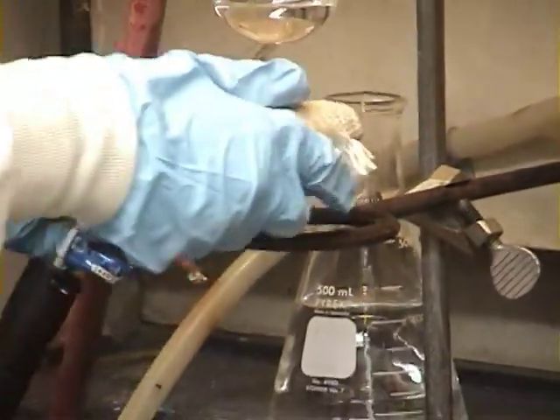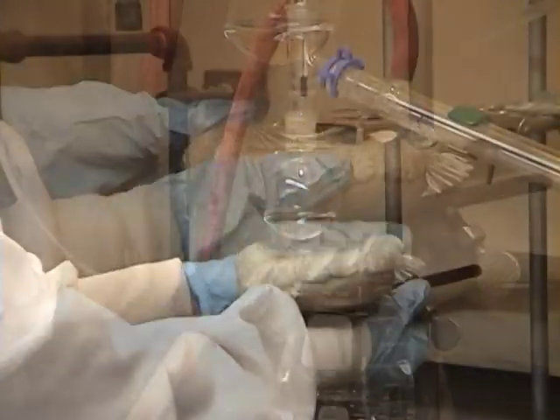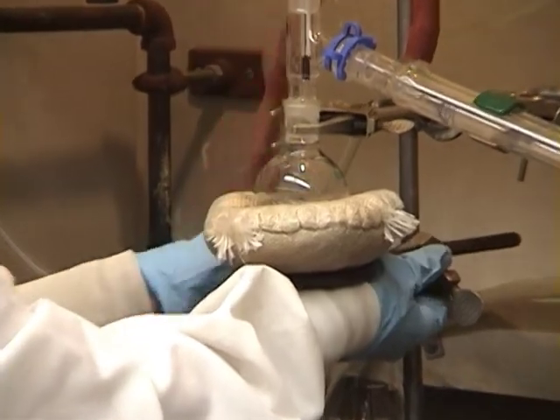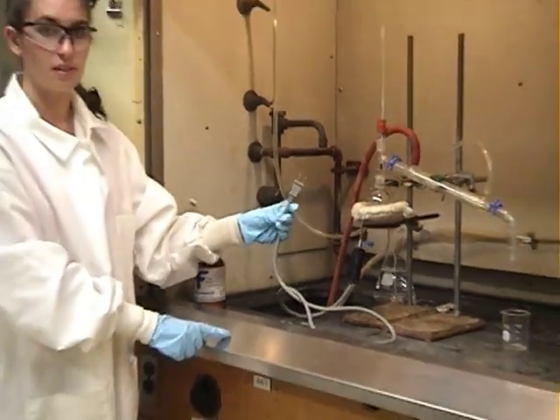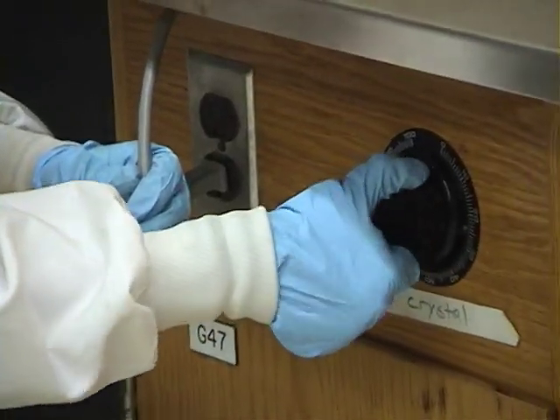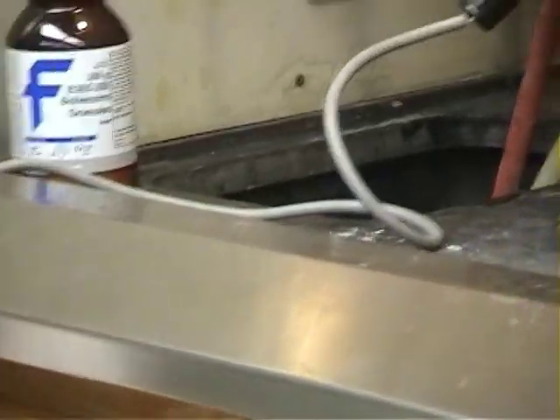An iron ring is used to support the heating mantle, which is moved upward to snugly cup the round bottom flask. The cord of the heating mantle is tucked under the ledge of the hood, and then plugged into the outlet under the ledge, where it can be controlled by the variac dial.